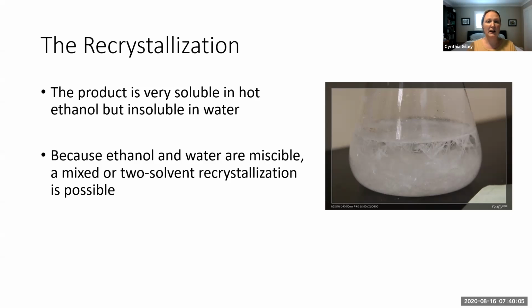As the water and ethanol mix, you're changing the percentage of ethanol and water in the mixture as you continually add more water. Eventually, the water outcompetes the crystals for solubility in the ethanol, and the water essentially displaces the solid so that it will not be as soluble anymore in the ethanol. Once you reach a cloudy state, right, it's essentially close to what's called supersaturation, where nucleation and crystal growth can occur. At that point, you would put it into an ice water bath to allow it to cool, and hopefully crystals will grow.